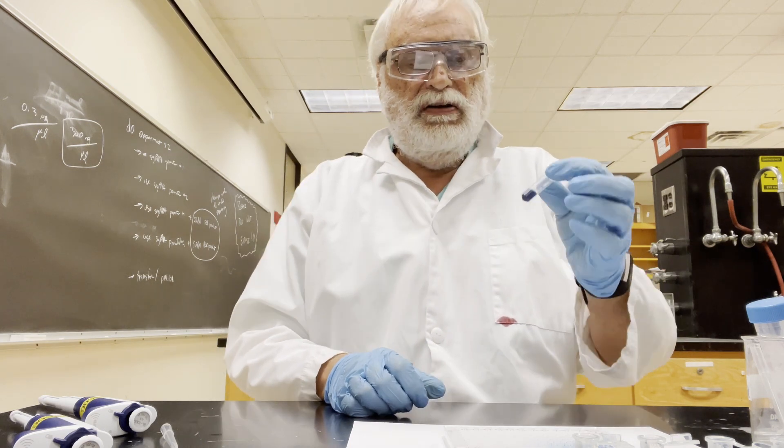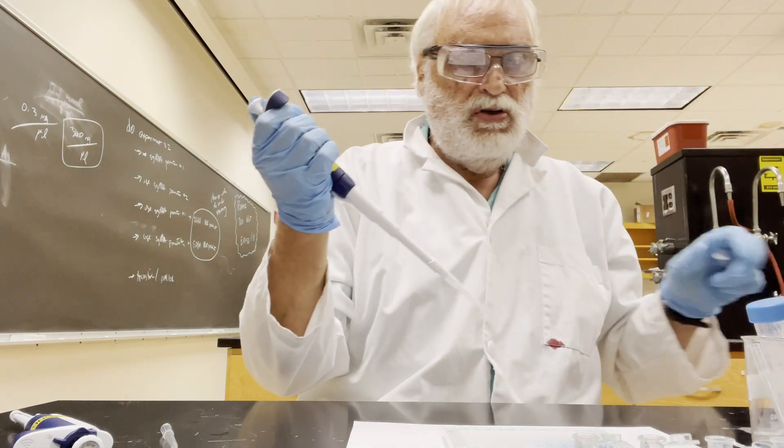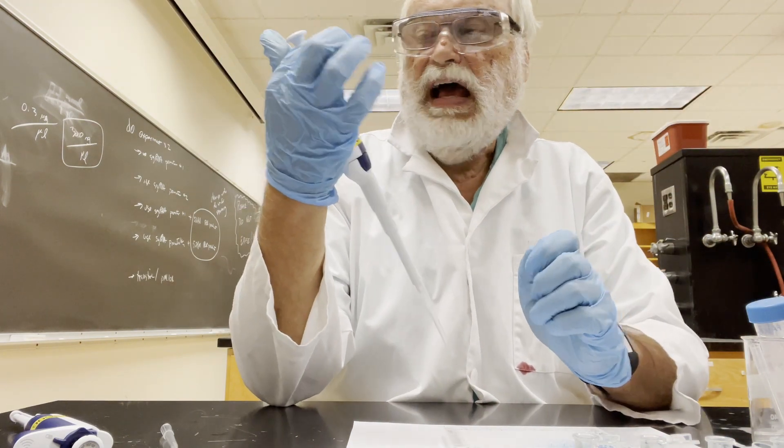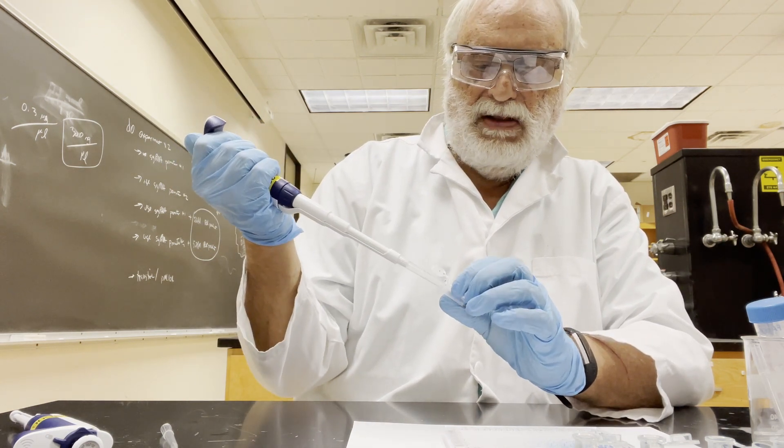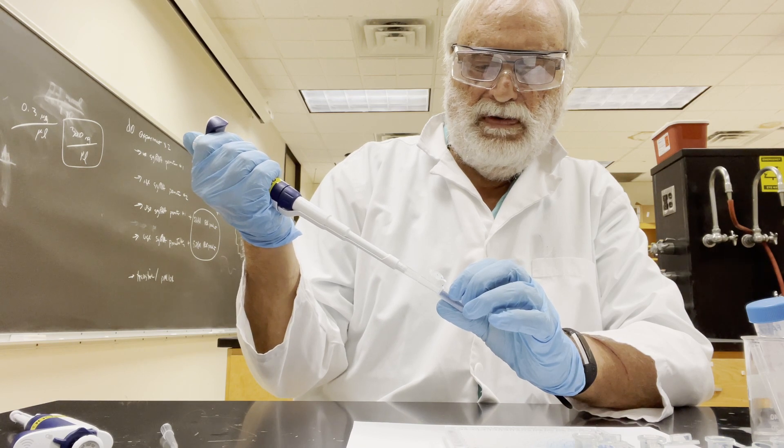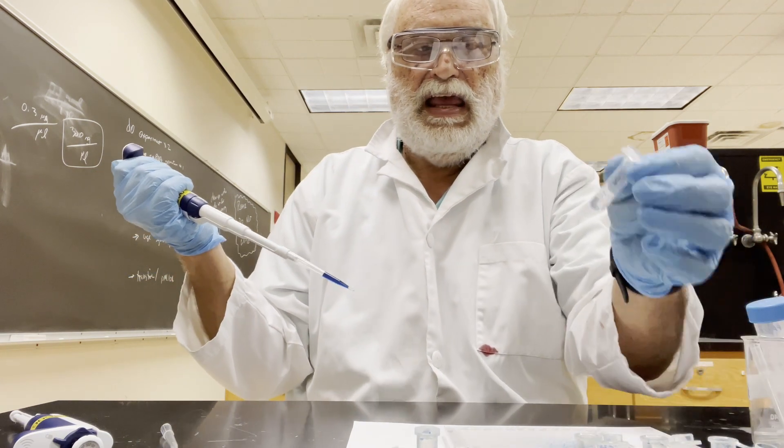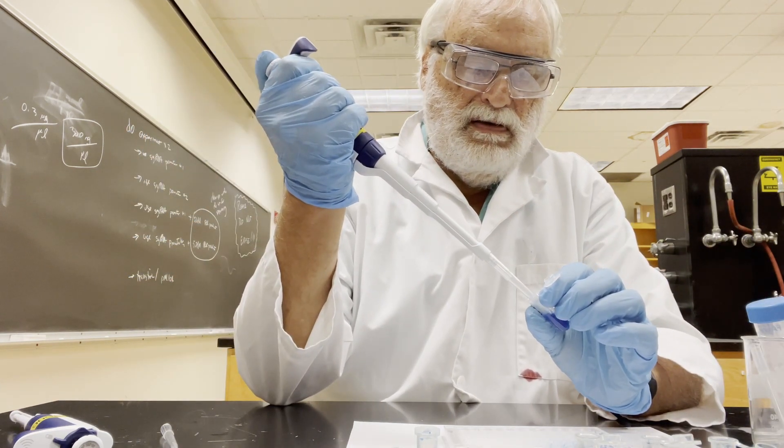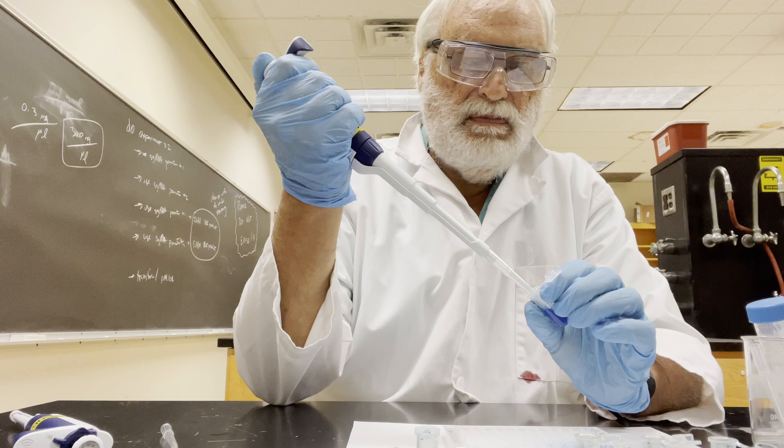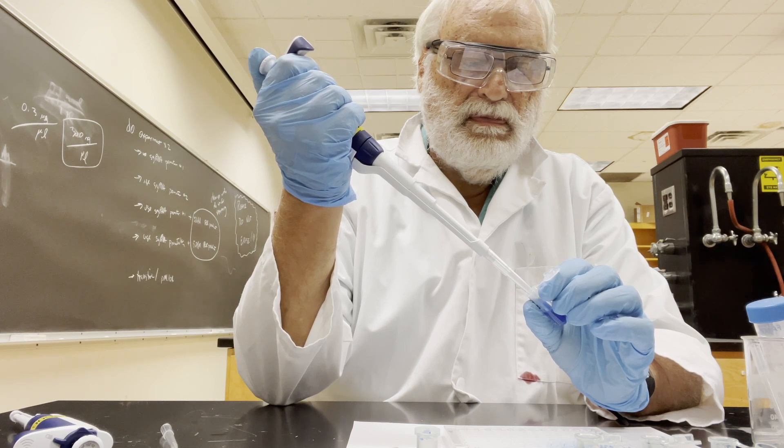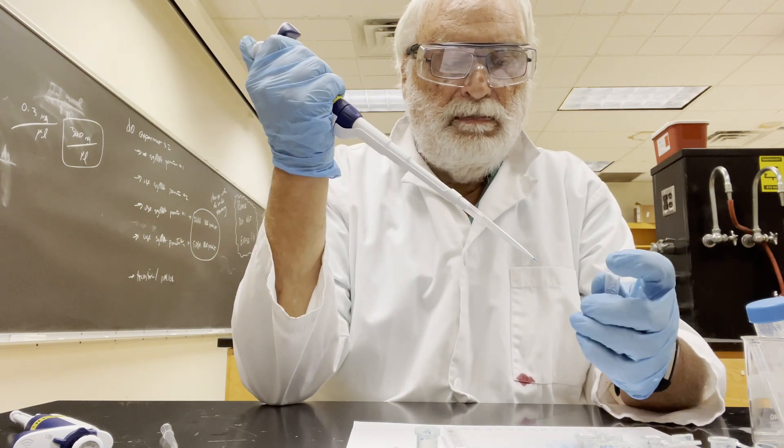So I have a solution here of blue dextran. I'm going to change my pipette to a half a milliliter. I'll take a half a milliliter out of this tube and I'm going to add it to the 0.5 percent tube. So I'll go ahead and mix this up, the same way I put the tip on the very bottom of the well.